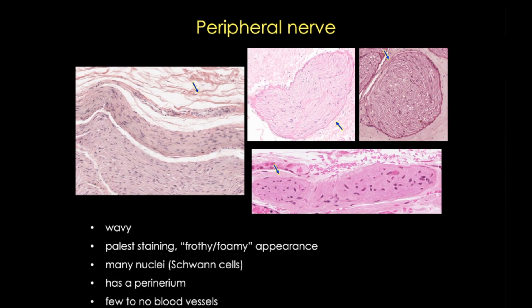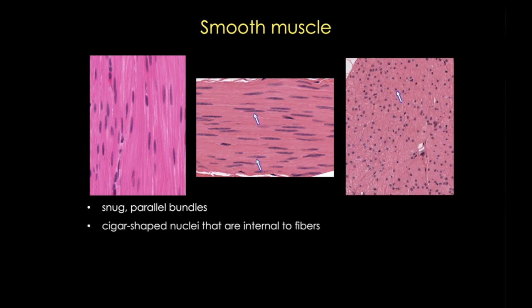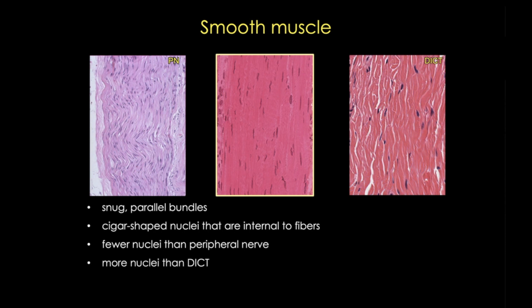Now let's compare to smooth muscle. Smooth muscle cells have unbranched, snug, almost parallel fibers. A small smooth muscle bundle can resemble peripheral nerve, but it lacks that connective tissue sheath or perineurium. Smooth muscle cells have very characteristic S- or cigar-shaped nuclei, and unlike peripheral nerve nuclei, they are internal to the fibers — you can see that best in the transverse section on the right. In terms of number of nuclei, smooth muscle has fewer nuclei than peripheral nerve and more nuclei than dense irregular connective tissue.